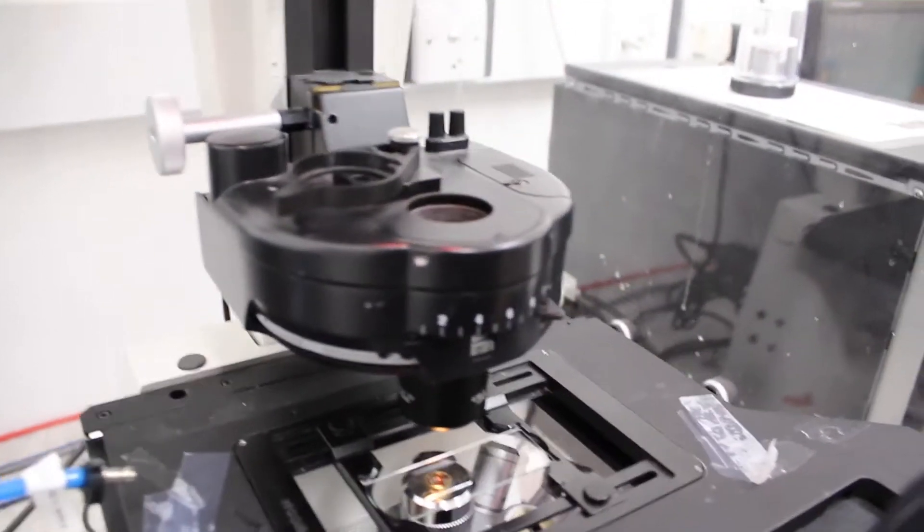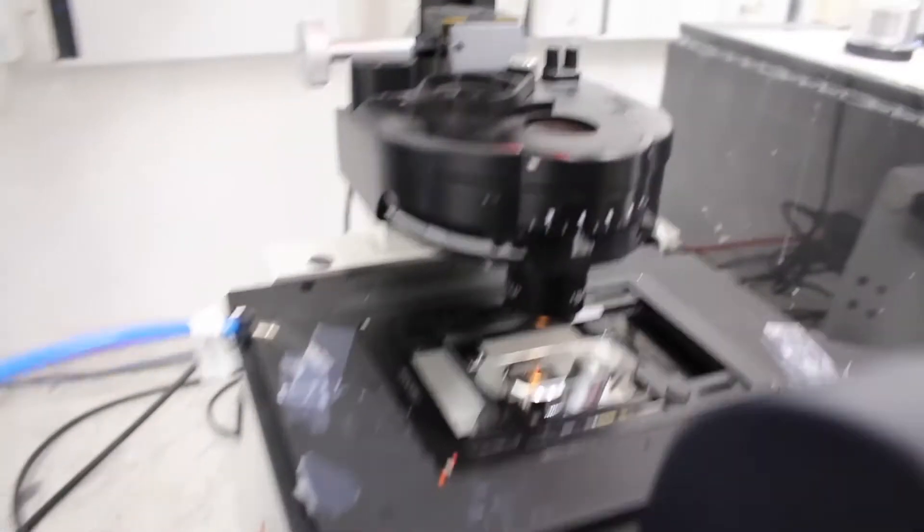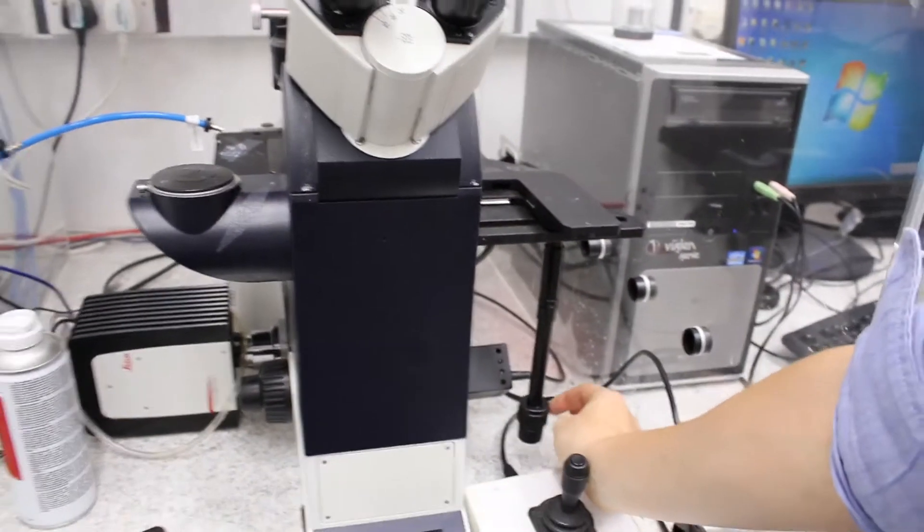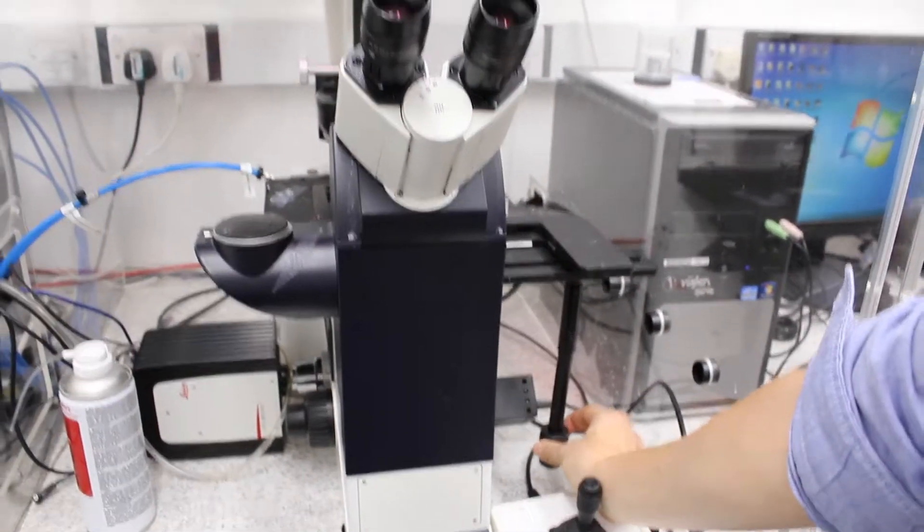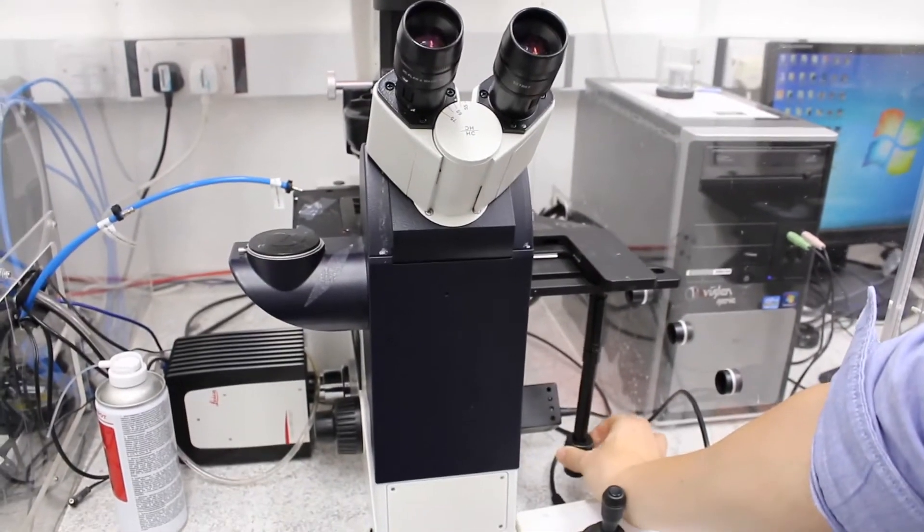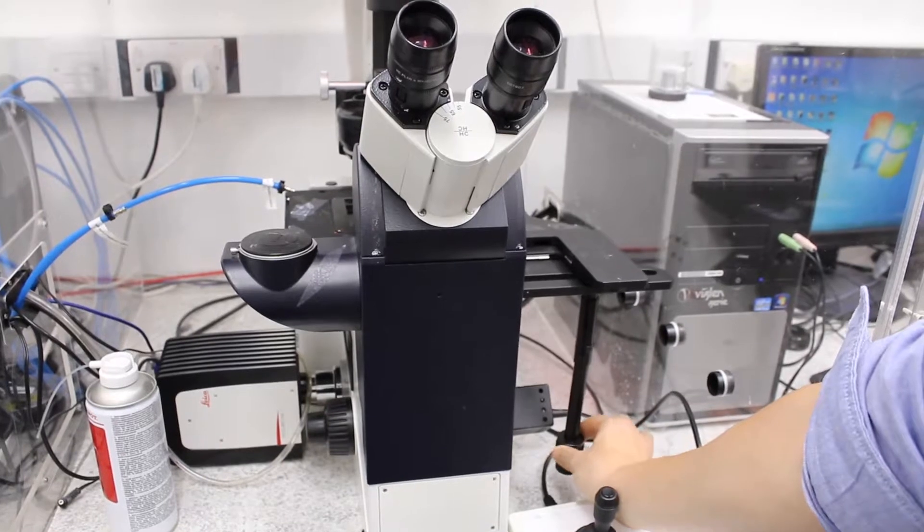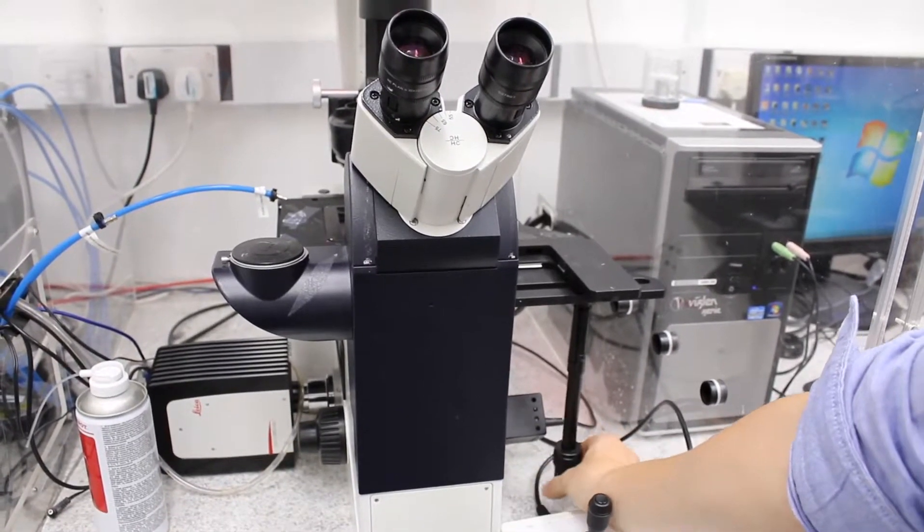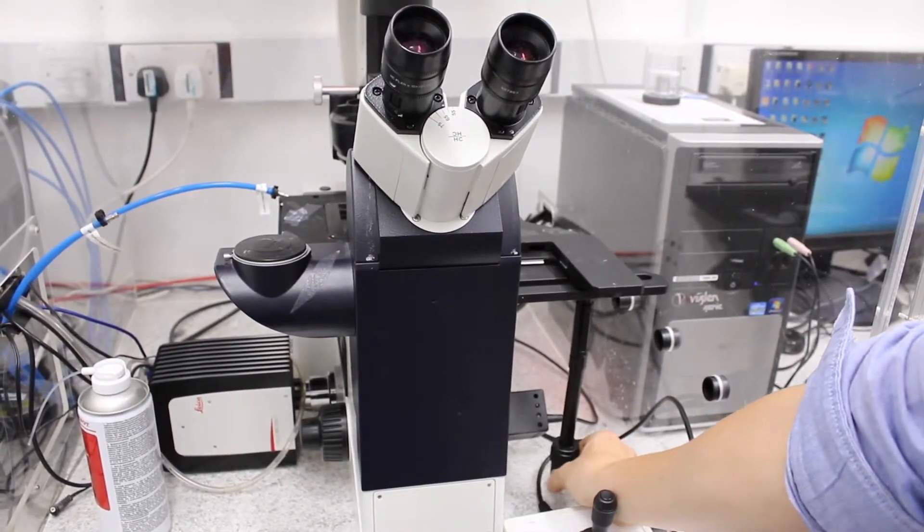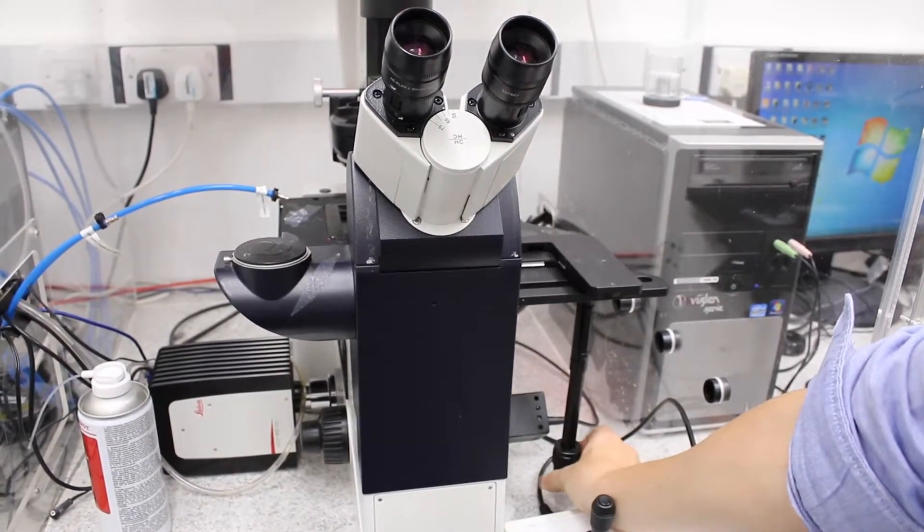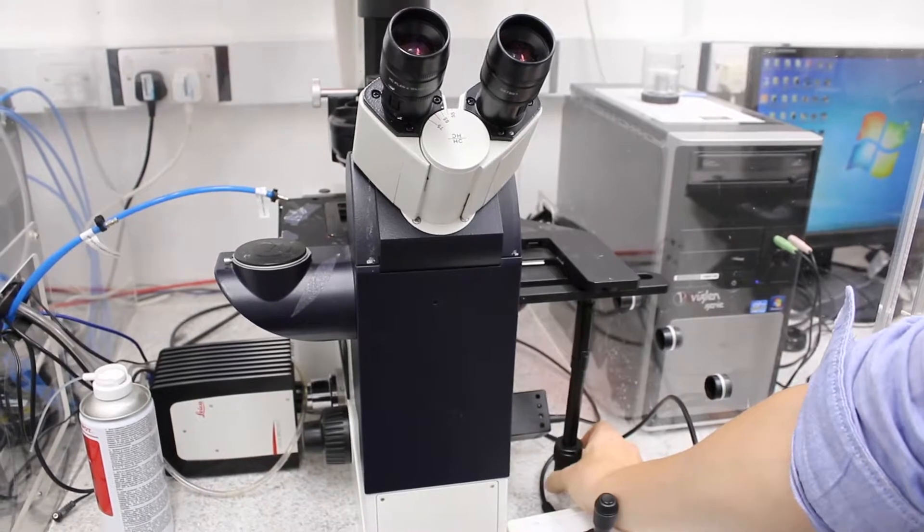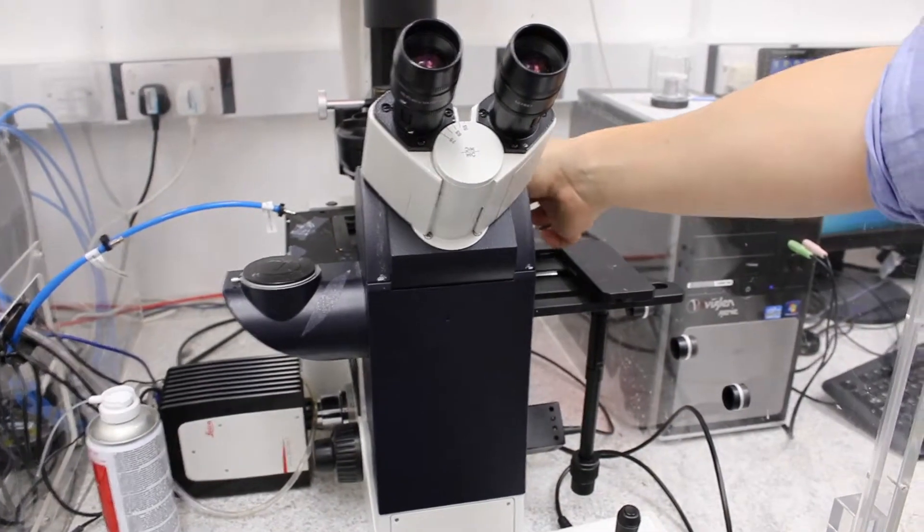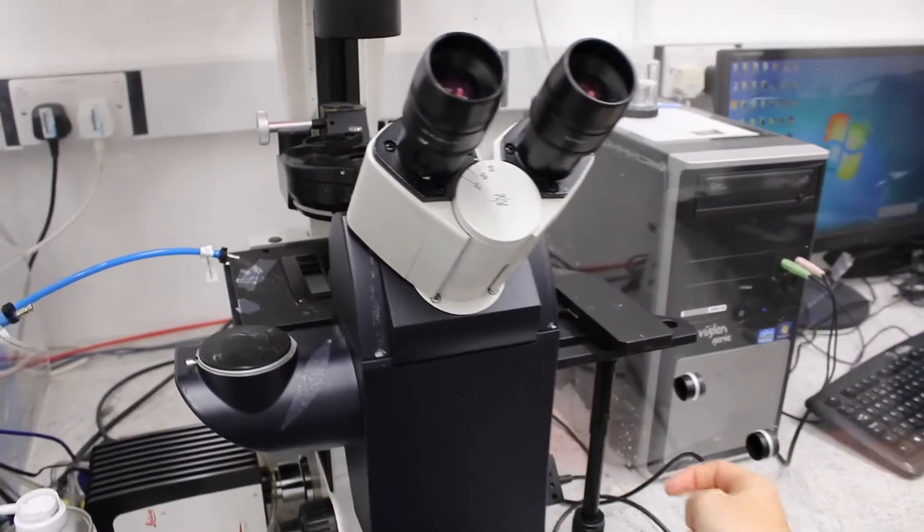so for that you have to move X and Y in the sample stage. So for that there are two wheels here, one moves the Y direction or X direction, it doesn't matter, the other moves the other direction. So you center and you see the light going to your sample.